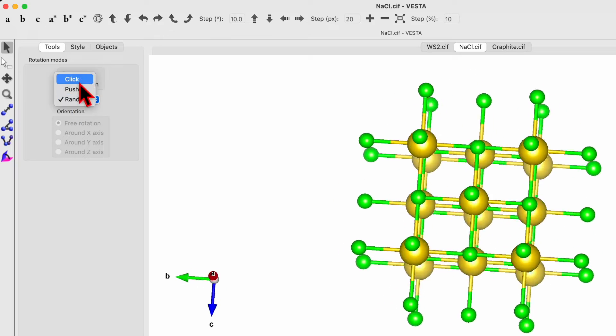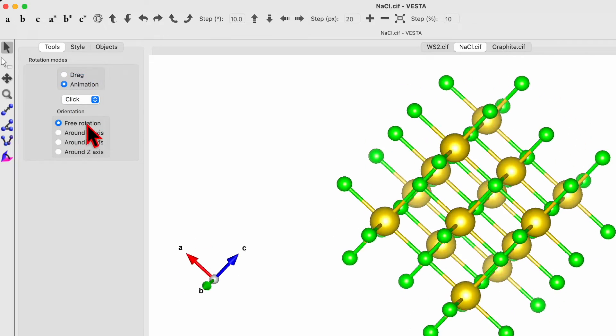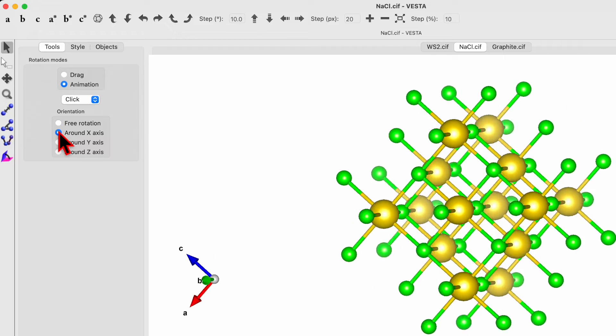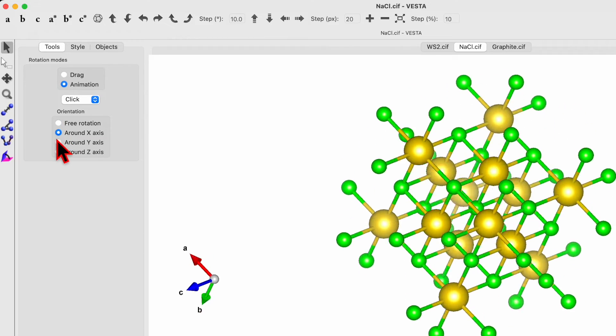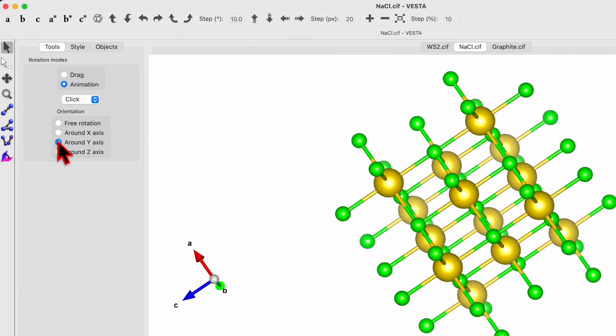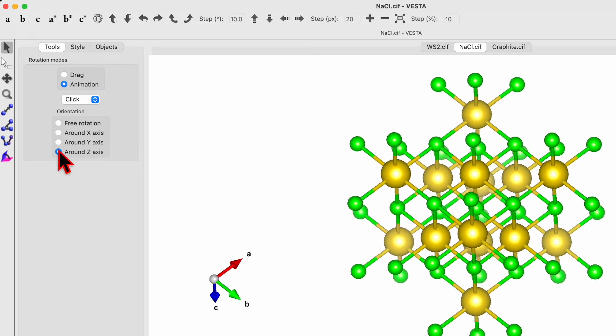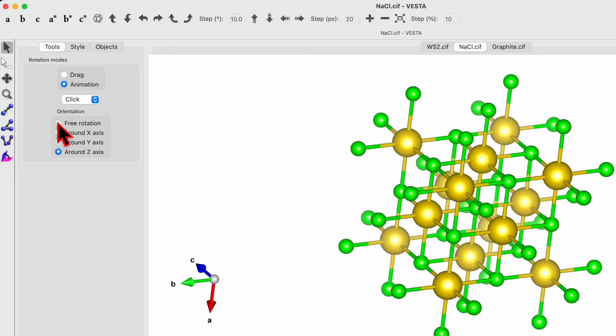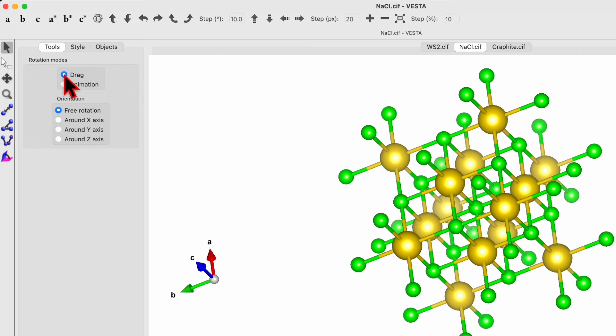So let's go back to the drag. And here you can change free rotation to around X axis, then around Y axis, and then around the Z axis. So back to the free rotation, back to the drag. That's by default.